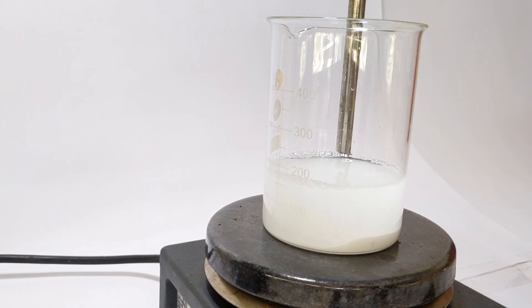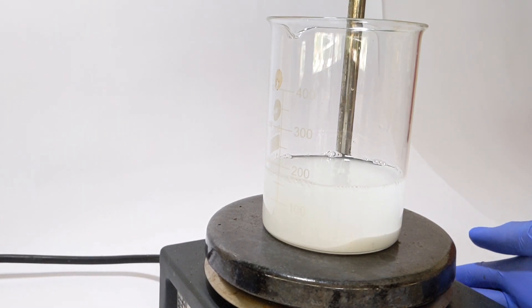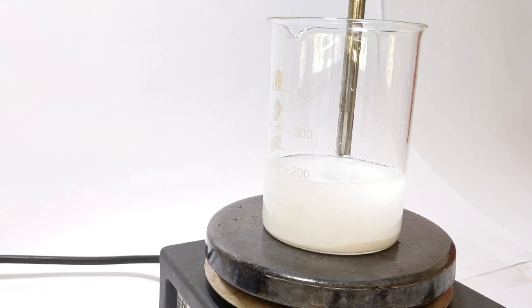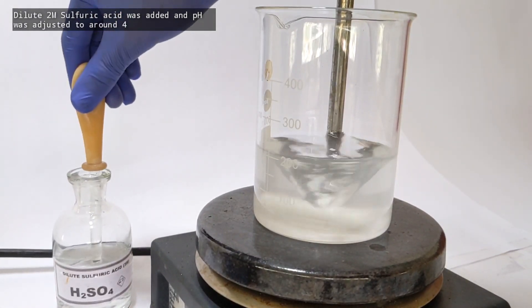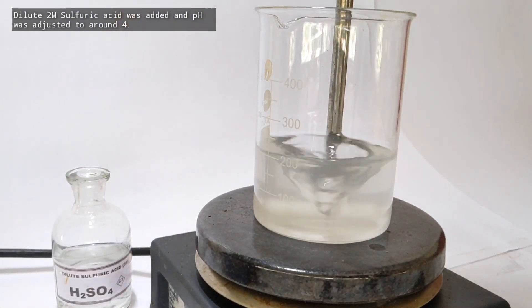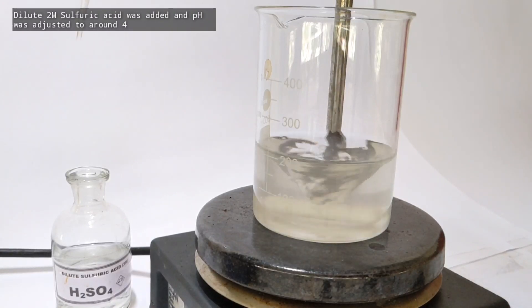Stirring was turned on and continued until everything dissolved. It took around four to five minutes of stirring to get everything completely dissolved. Finally we were left with a clear solution. Now a few milliliters of dilute 2 molar sulfuric acid was added using a glass dropper in order to make the pH around 4. I added about 15 milliliters of acid in total.